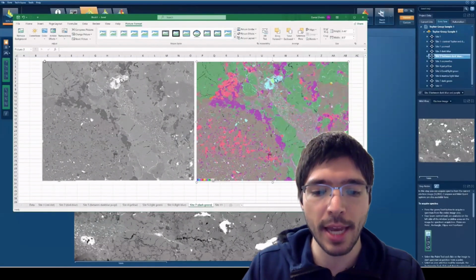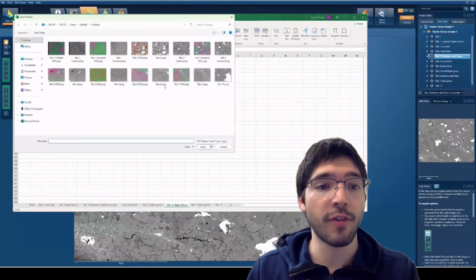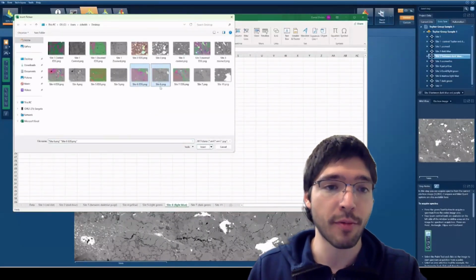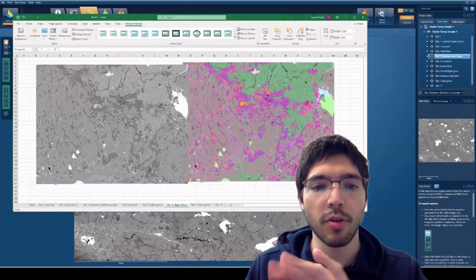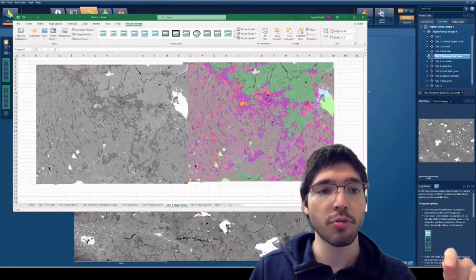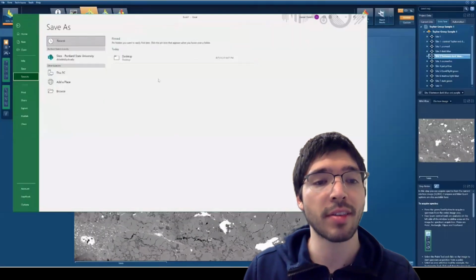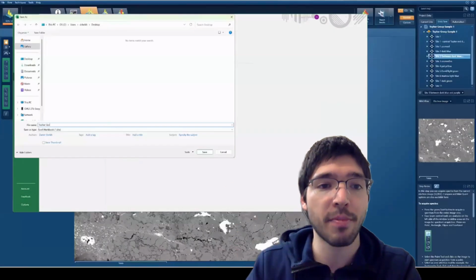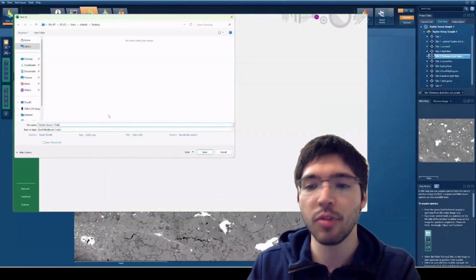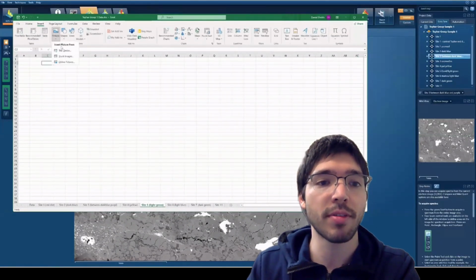So you can get analyses that are very clean, good mineral phases with good cation sums, stoichiometrically perfect, but their totals are just lower. That's because the beam stability during data collection is not as stable as on the electron microprobe, where they specifically fix it at something like 20.00 nanoamps, because that instrument is tailored for quantitative data collection.